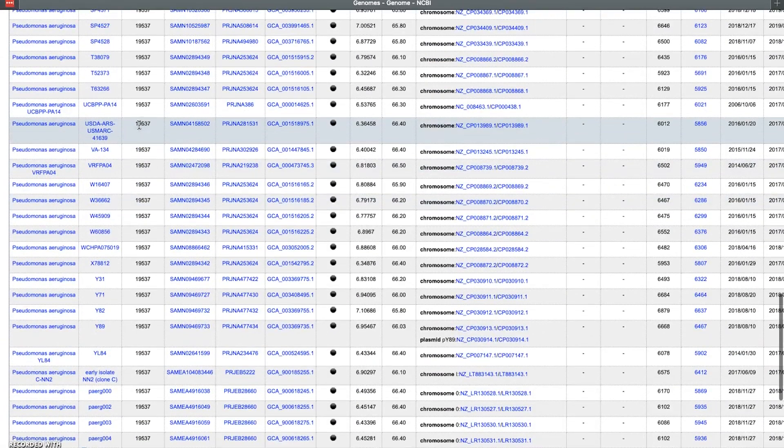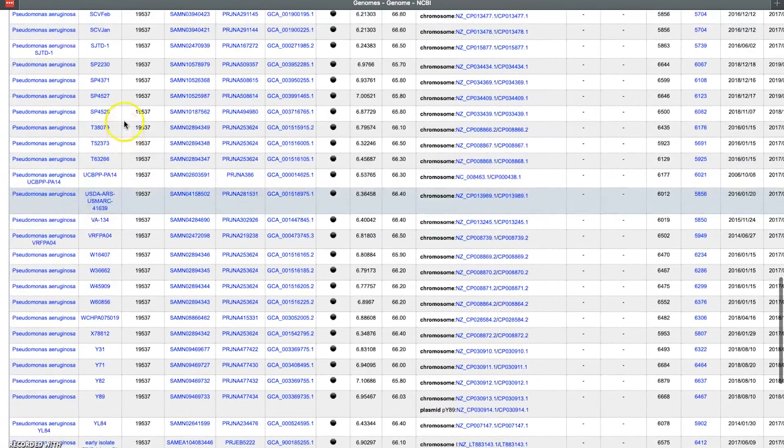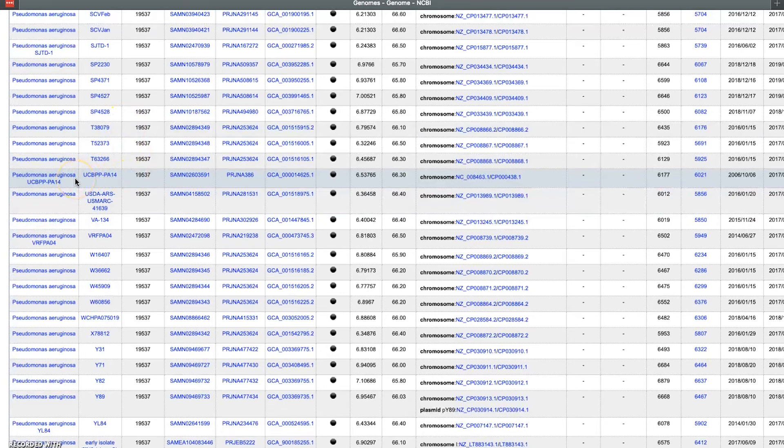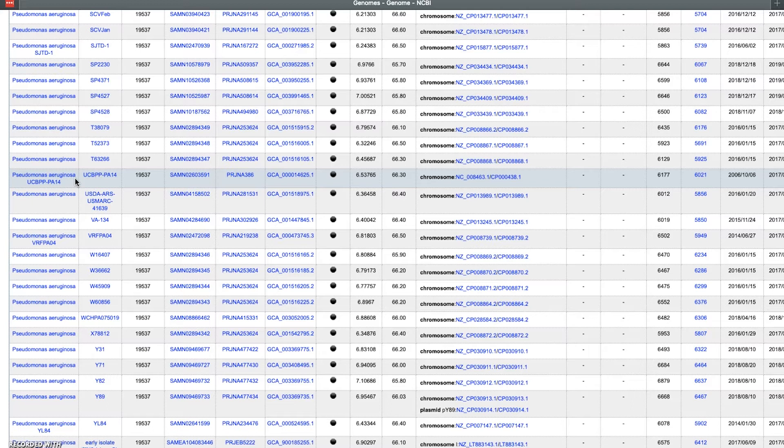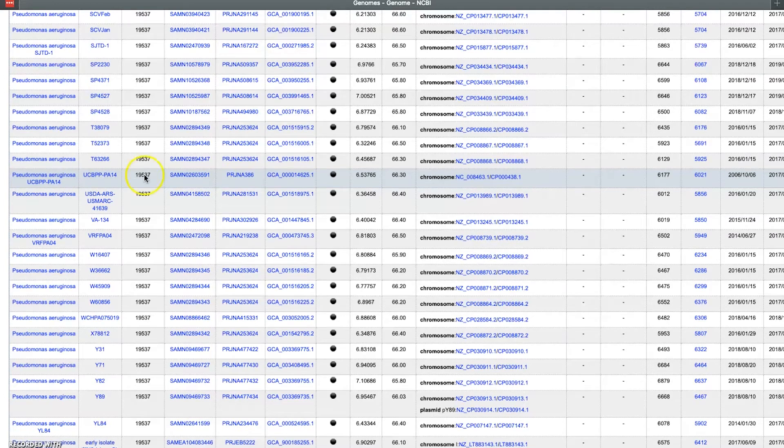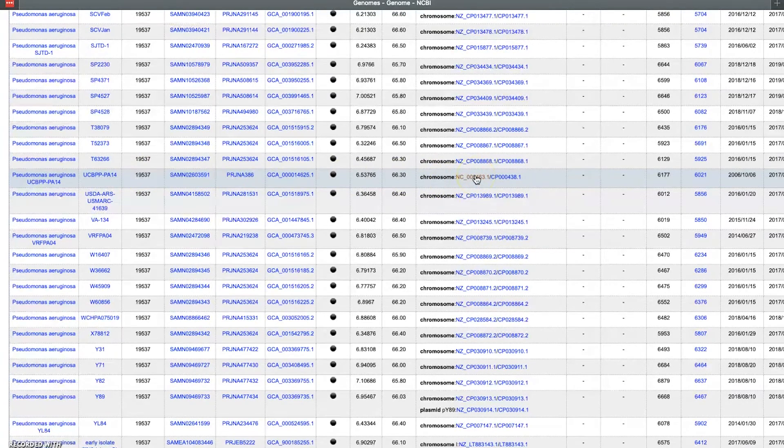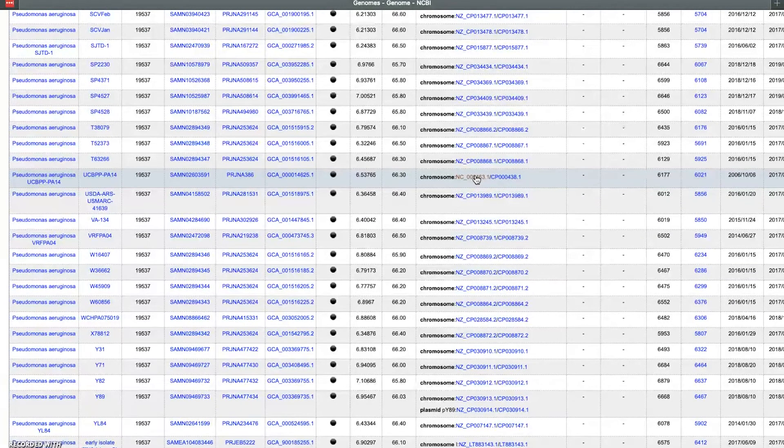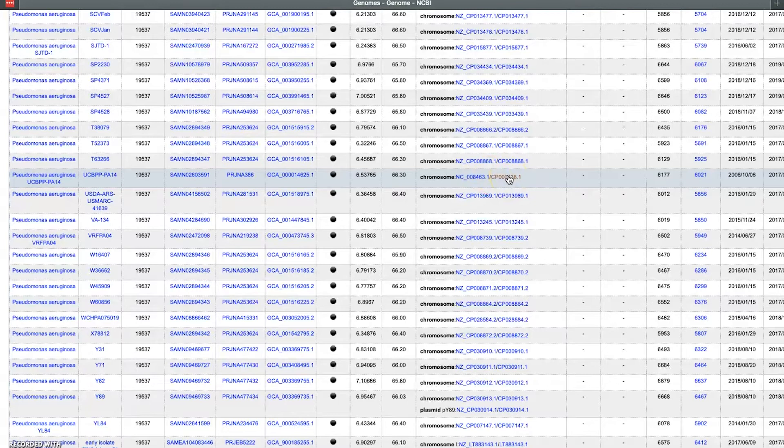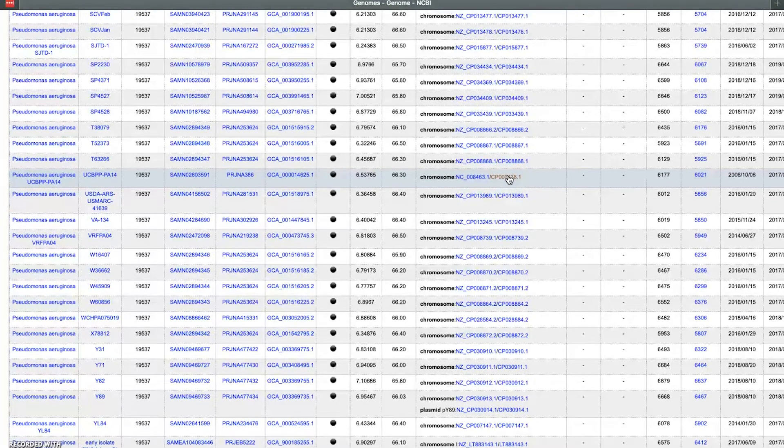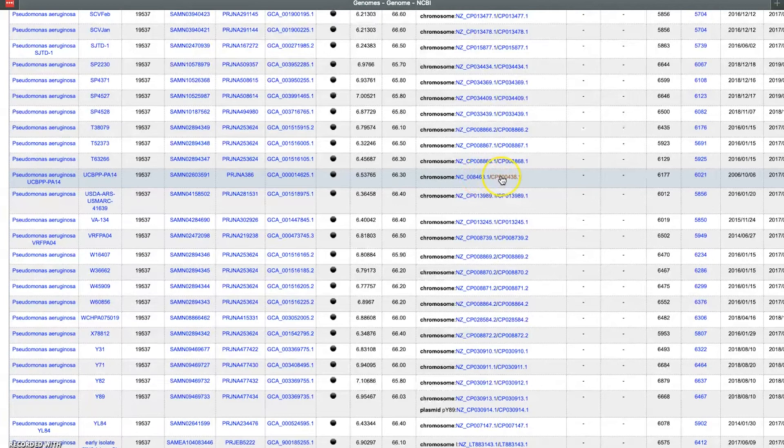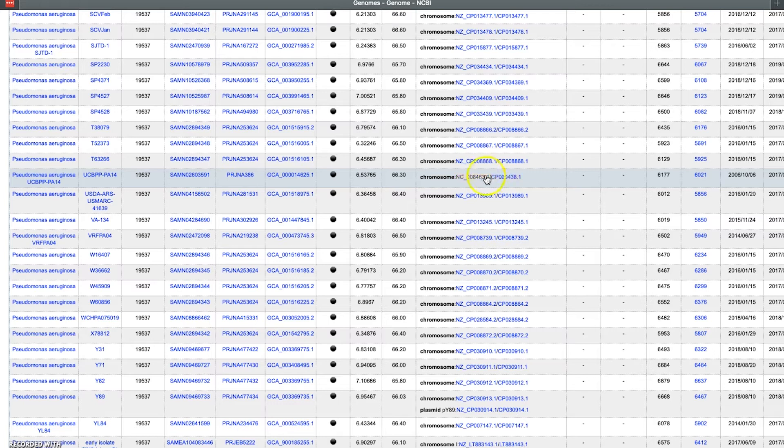And we're looking for UCBPP-PA14, and there it is. So in this particular case, this is the reference genome we're trying to find. What we want to do now is look over to the right, and we'll see that there's a couple of listings here. The NC is the RefSeq accession number, and then right next to it is the GenBank CP accession number. Presumably these are two identical sequences deposited in the RefSeq database and the GenBank database. They should be identical. What we want to choose is the NC_008463.1 genome, so we'll just click on that.